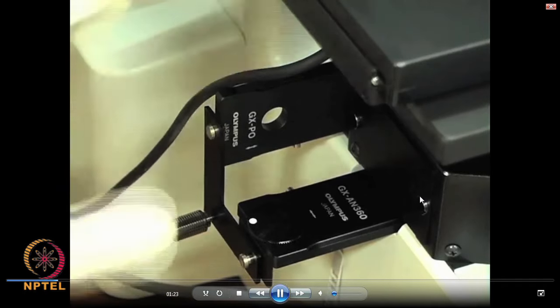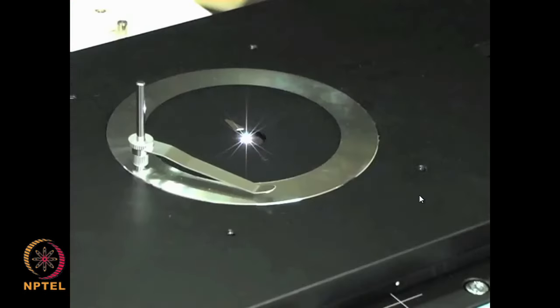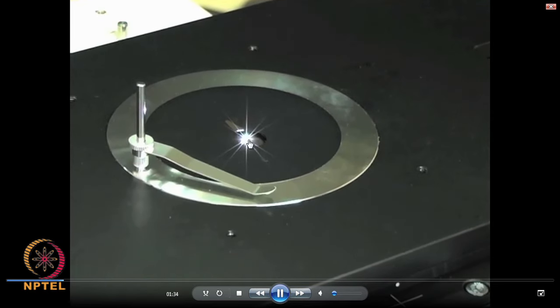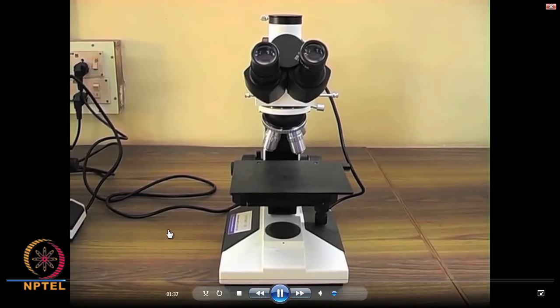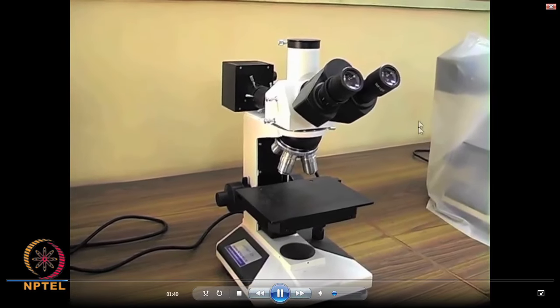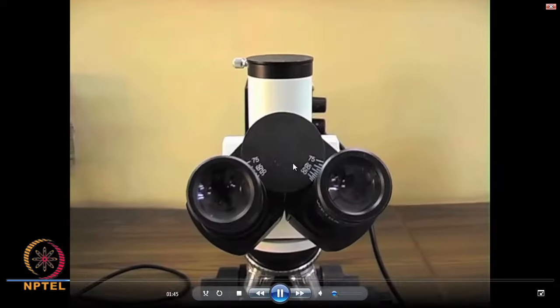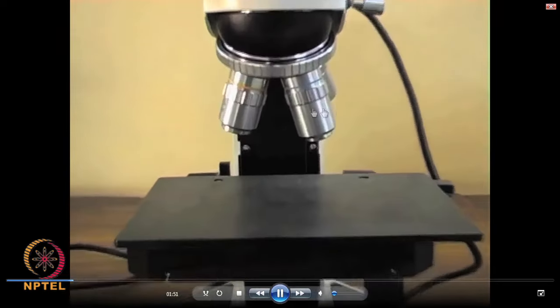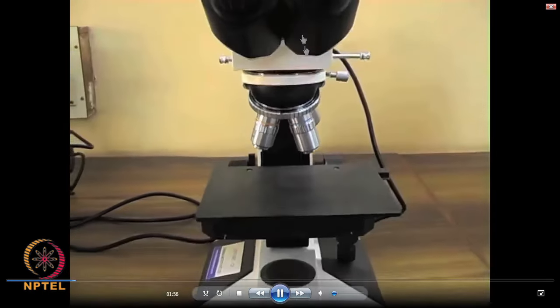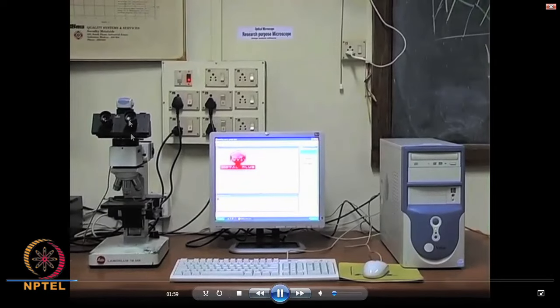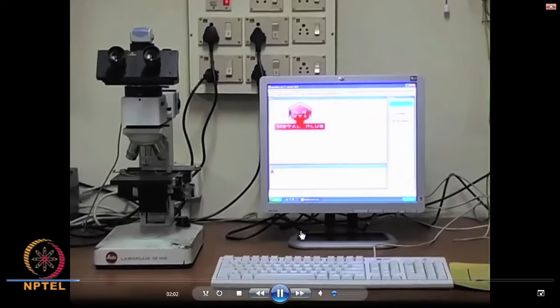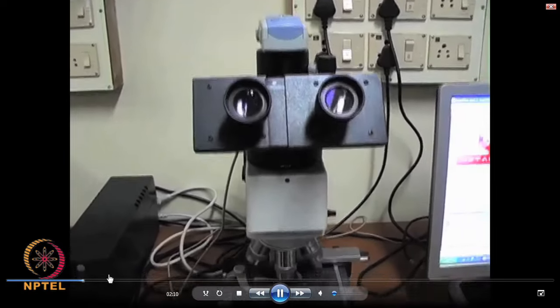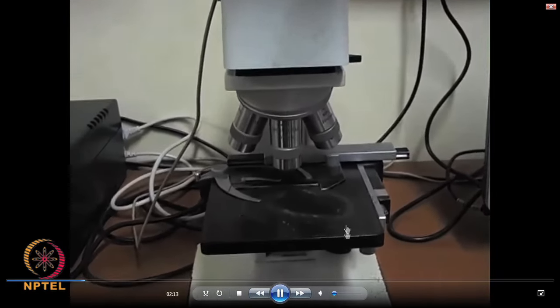These attachments we will take up as and when we deal with the variation of the microscope. What you are now seeing is an illumination stage where the sample is kept. This is a simple vertical type metallurgical microscope which I introduced in the last class. This is the specimen stage, these are all different objectives, and this is your ocular — the other one is attached with the image analysis system.